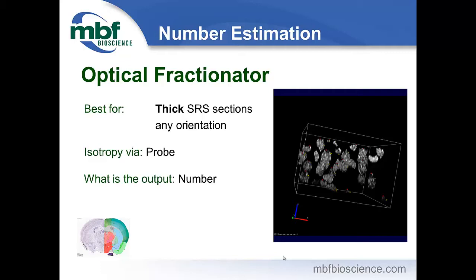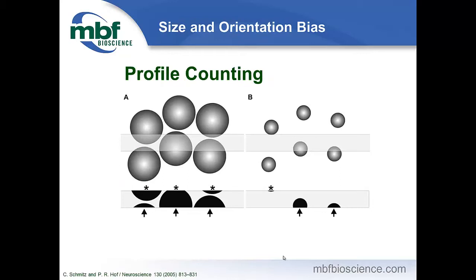Right? But why do we need to compare the appearance of objects through thick tissue? Well, the reason you would want to use thick tissue and not thin tissue is so that you can have many optical planes and find the tops of more than one particle as you focus up and down. So you think the tops are really important, right? And that's because of this.